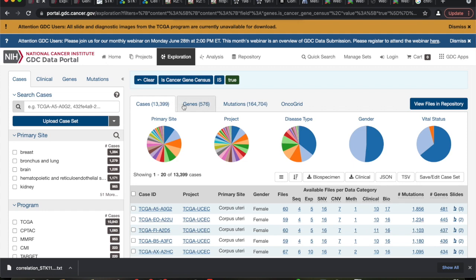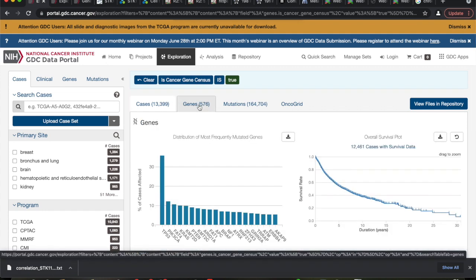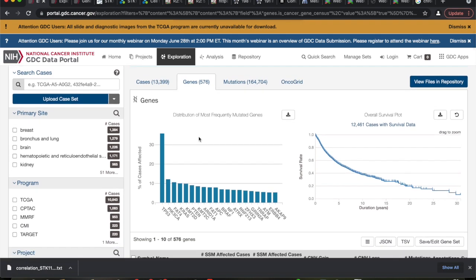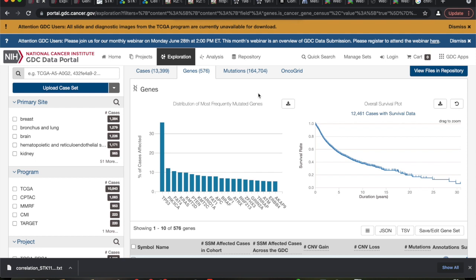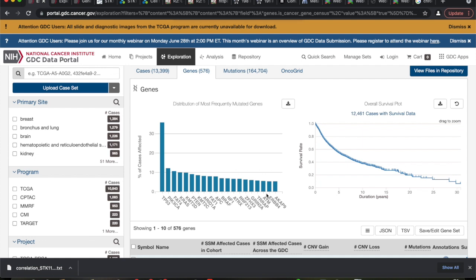Go over here and click on Genes. This shows you a distribution of the most frequently mutated genes. What gene is mutated the most in cancers? P53, for sure, by far. And is it a good guy? Yes — so these are basically the godfathers of cancer we're looking at right here.